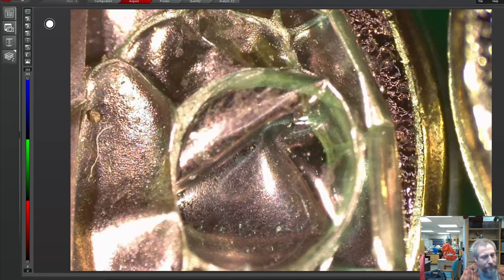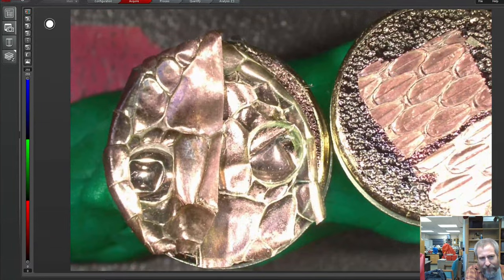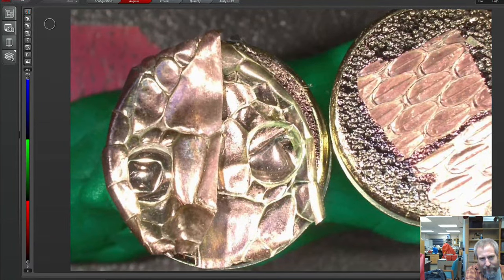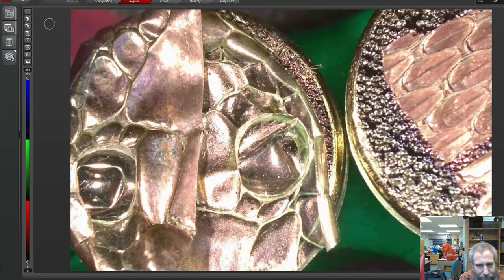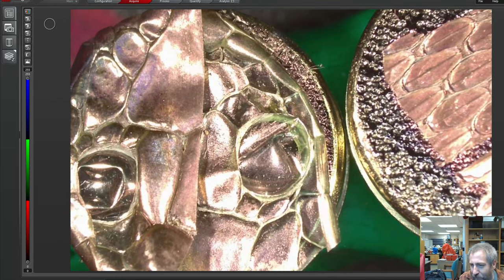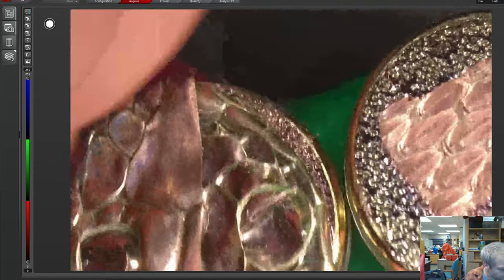The little eye plates. Now you can kind of make out that it's a snake. If I zoom out, you can see its eye. And then it was an inside view of its eye and an outside view of its eye, I think, that Pacific did. Okay. Well, it's totally random today. We're looking at whatever goes under the microscope.